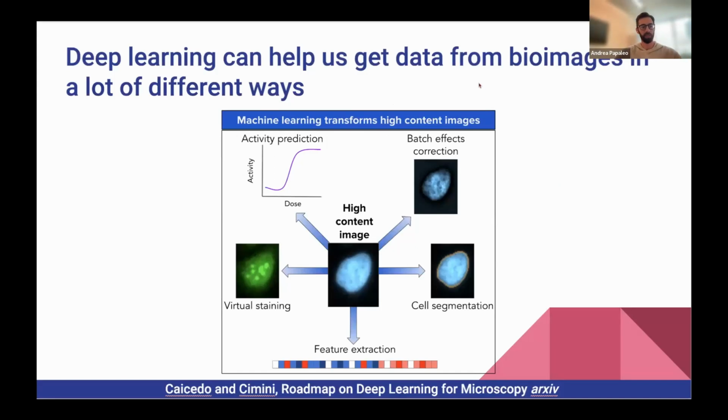So yeah, the reason why we're trying to expand upon the tools available to us for deep learning is because it gets us from data from the bioimages to actual results and insights in a very quick and efficient way. I'm sure everybody kind of knows that. So instead of taking images with these microscopes and getting the cells and having to annotate them and classify them, it's much easier to do that using deep learning methods.